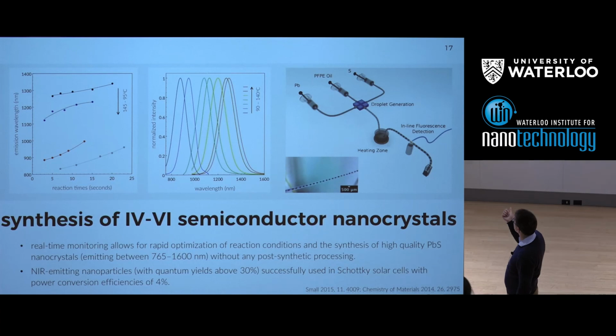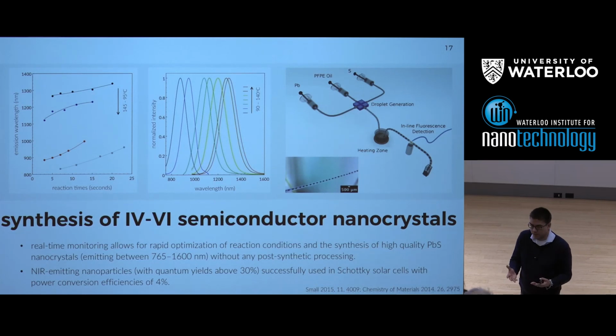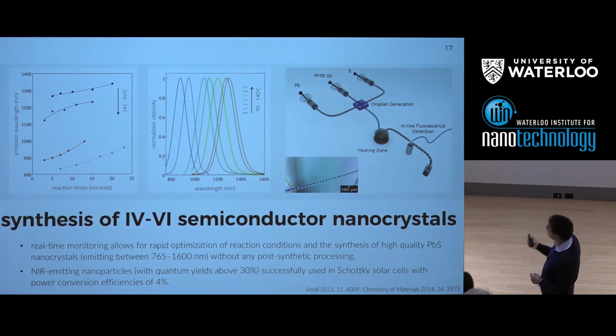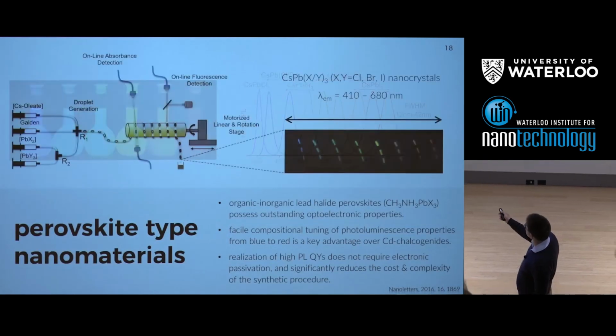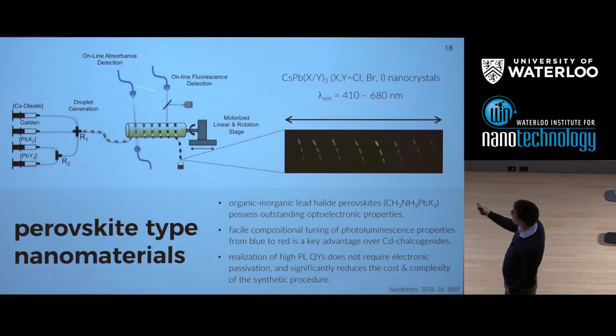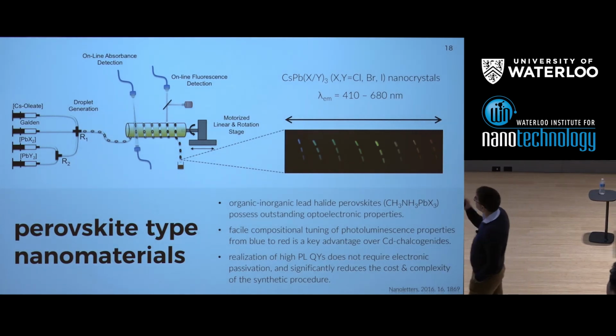And often for these kinds of syntheses, the reason that you heat for extended periods of time is because, certainly on a macro scale, you're not able to heat in a uniform way. But these systems work very well. I would say, however, that this is actually a better way to heat the droplets in this case. It gives them enough time.